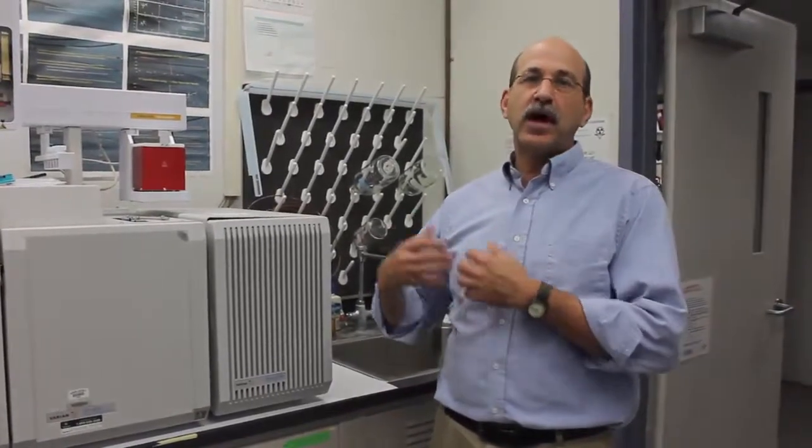Determination of unknowns is very important. One of the projects that we used this was to look for lots of unknown contaminants in drinking water. Drinking water is regulated for multiple compounds and metals, but not all. And there are far more compounds that are in our environment than are regulated in drinking water. So at one point in time, the New Jersey Department of Environmental Protection said, tell us what's in our drinking water. So we scanned the drinking water for every compound that we could find. And we found hundreds and hundreds of compounds.